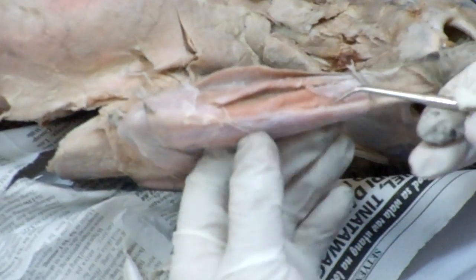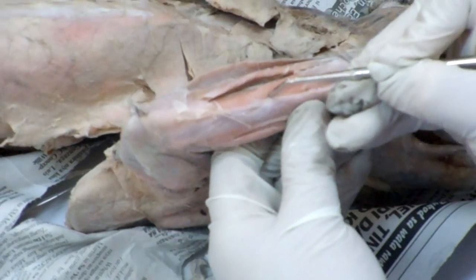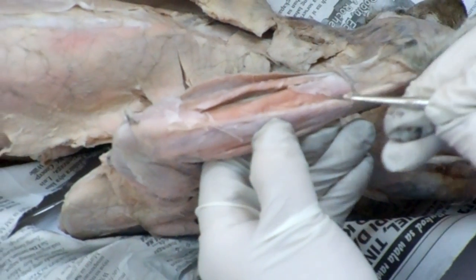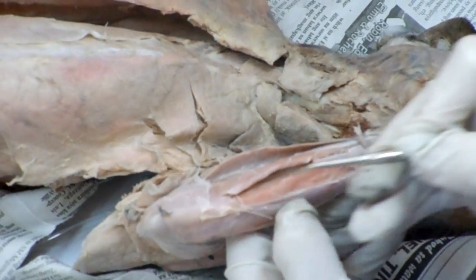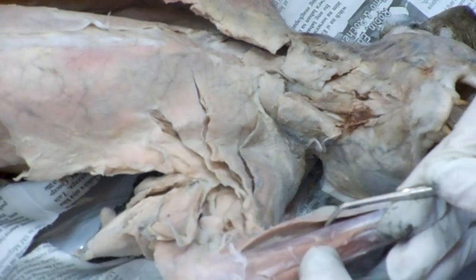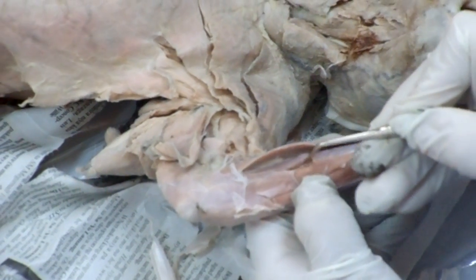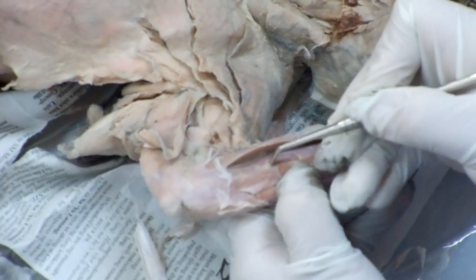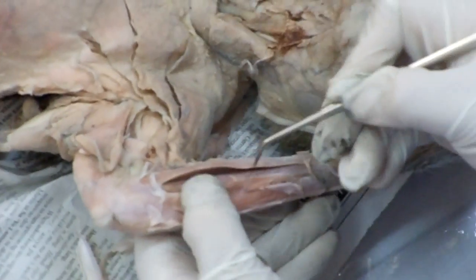Okay, then the last: flexor carpi ulnaris. So, yun. This flexor carpi muscle forms the ulnar border of the forearm from the medial view. It consists of 2 nearly separate muscles. One head is somewhat under palmaris longus. The other head lies alongside the exposed olecranon process of the ulna. Both heads join to a tendon near the wrist.